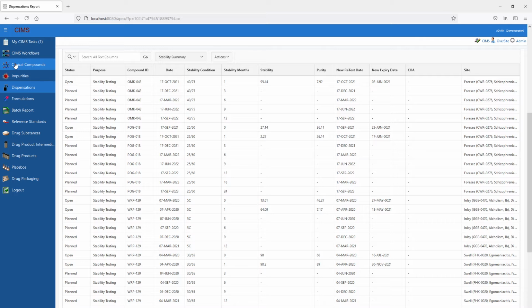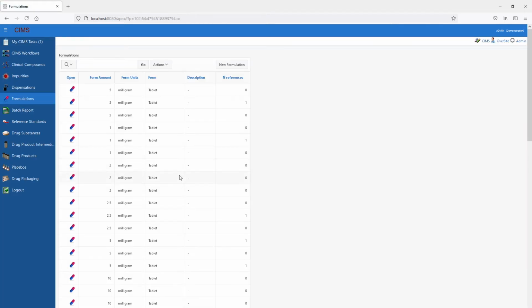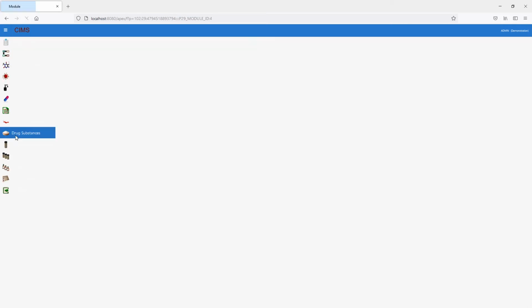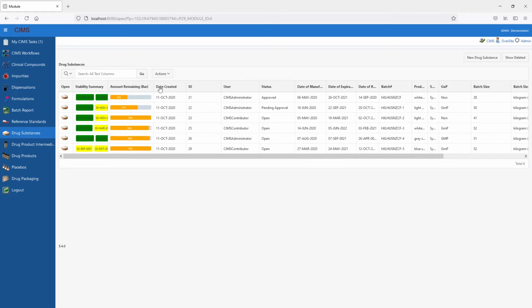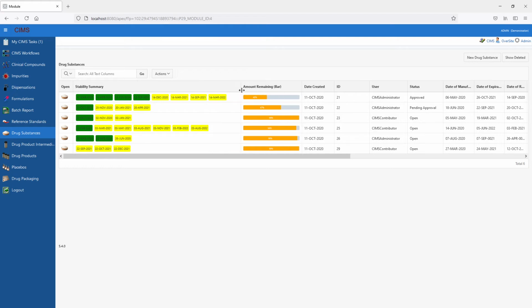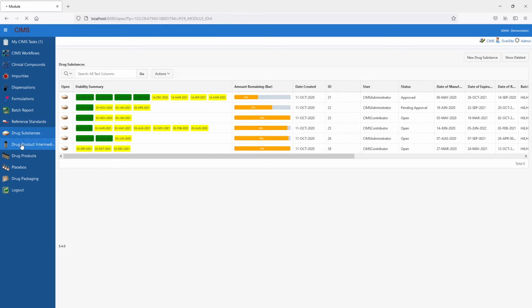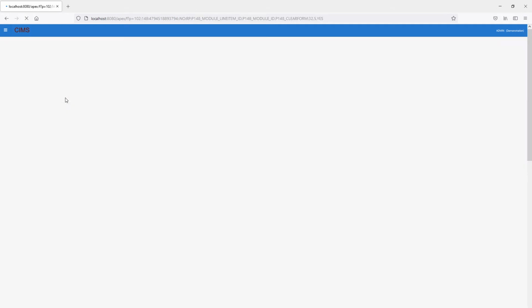The basic entities list, like formulations, and people with rights can pick which formulation is used in batches that are formulation based. This list is again manageable by those with rights. Each precursor type itself will also have an independent report that again can be downloaded. And what you see here are the fields involved in these precursors. So this is less configurable than your other reports, but is much more straightforward. And you can also open the entity from here with the icon.